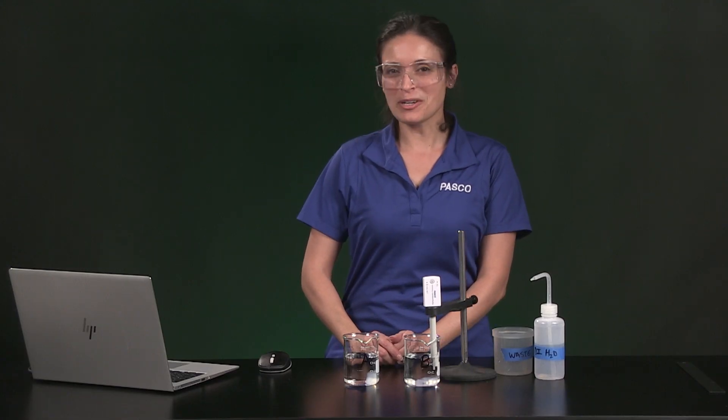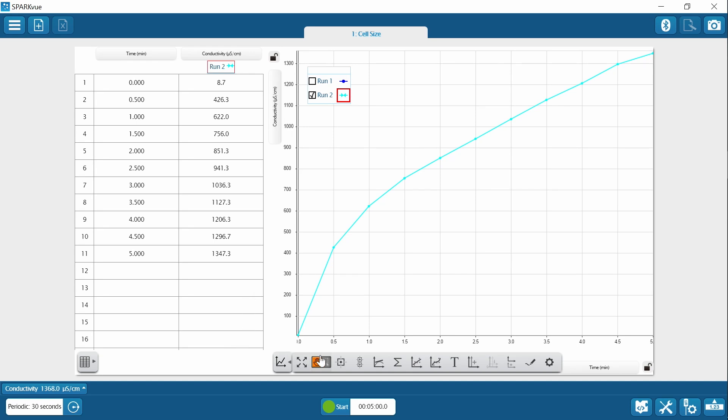You can use the coordinate tool in SparkView to see what the initial and final conductivity values were. When I turn on the tool, I can move the gray box and set it to whatever data point I want. And I can remove it by clicking the X.